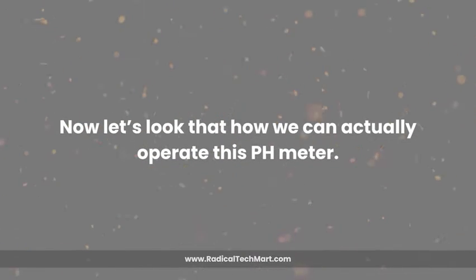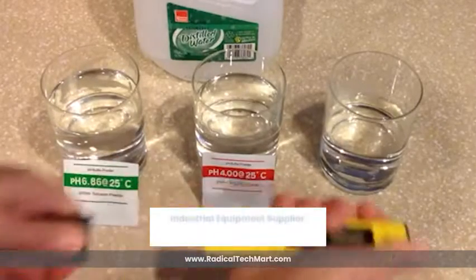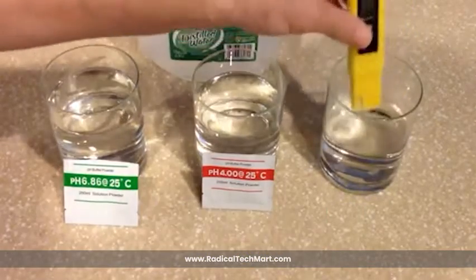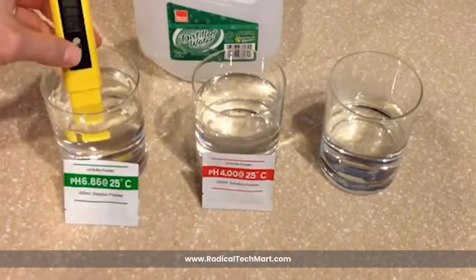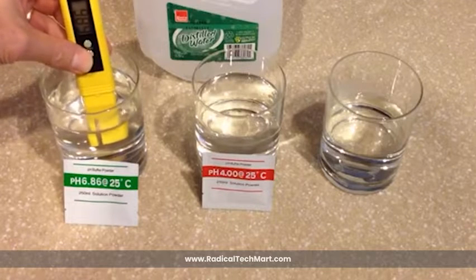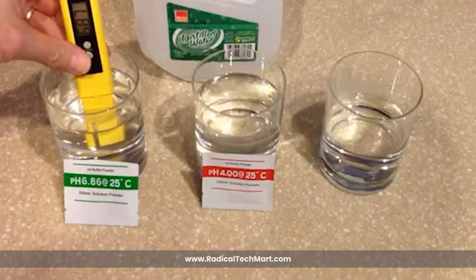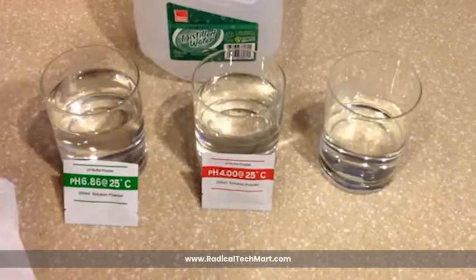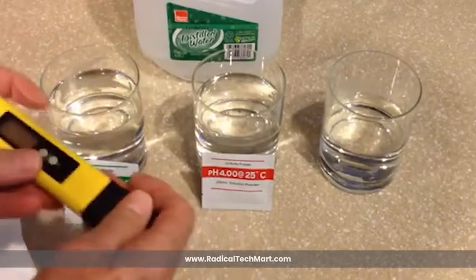Now let's look at how we can actually operate this pH meter. Remove the protective cap and any screen film attached on the meter display. Then rinse the electrode with distilled water and gently dry it with a tissue. After that, press the on/off button to power on the device. Then immerse the electrode in the test solution, ensuring it's below the immersion line. Stir gently and wait about 30 seconds for the reading to stabilize. After measurement, rinse the electrode with pure water and power off the device.